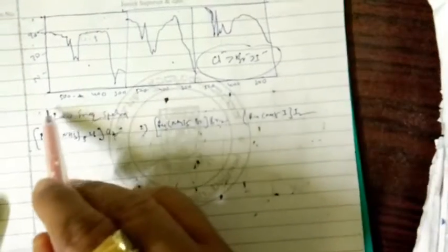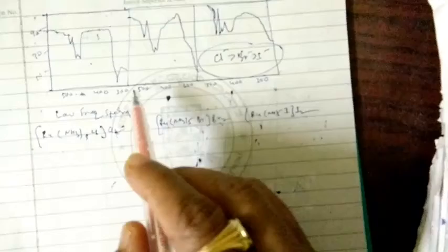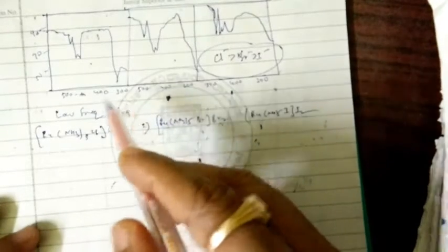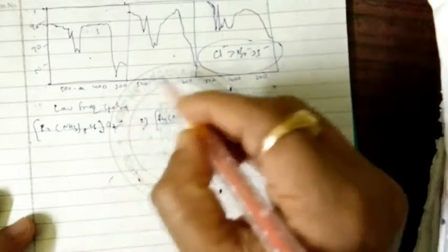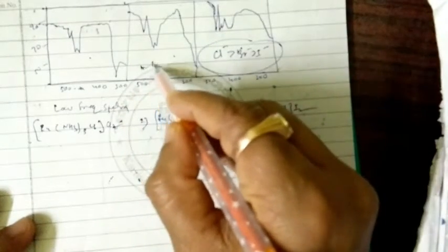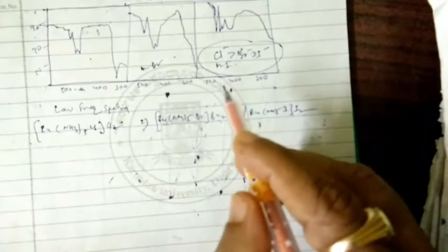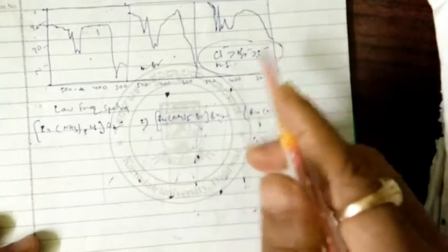You can see the 650 to 250 range for ruthenium nitrogen stretching vibrations, and the ruthenium chloride stretch is expected to occur here. The metal bromine and metal iodine stretching vibrations should occur at a lower frequency actually.